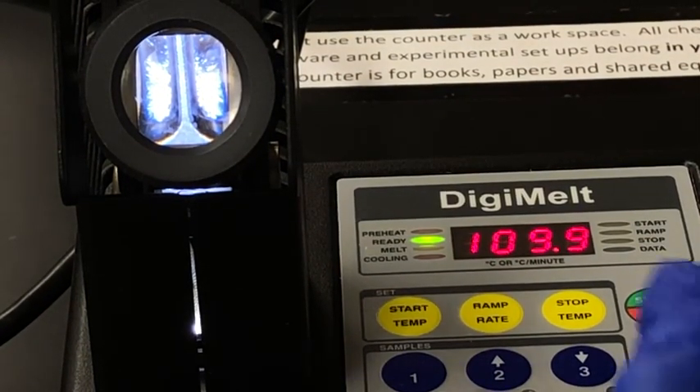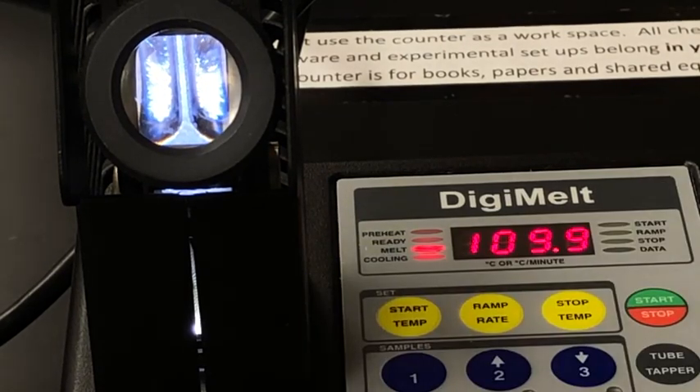Now I'm going to hit start and the temperature should start increasing. I will fast forward until we see a change in one of our samples.